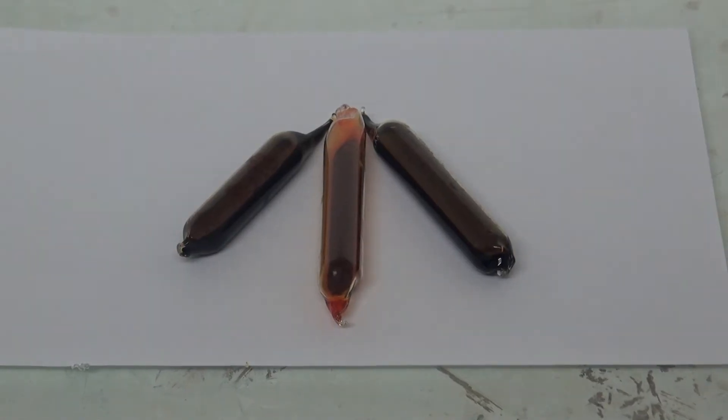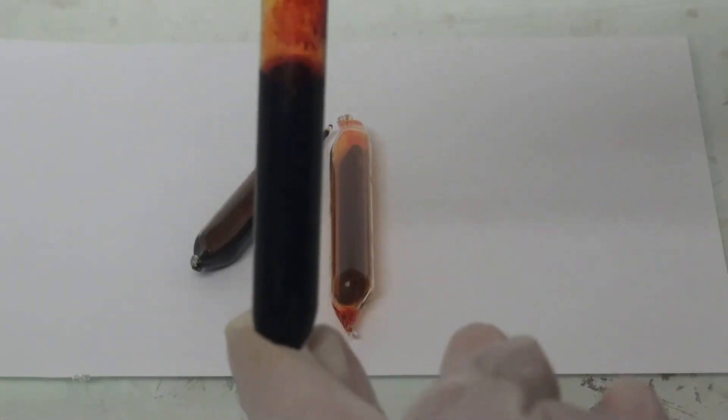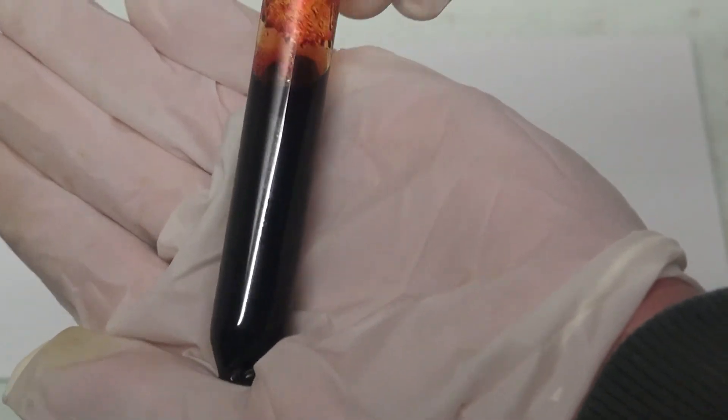And now here we have it, 3 beautiful ampoules filled with elemental bromine. The bromine is still wet, but that's a problem I will solve when I use it.